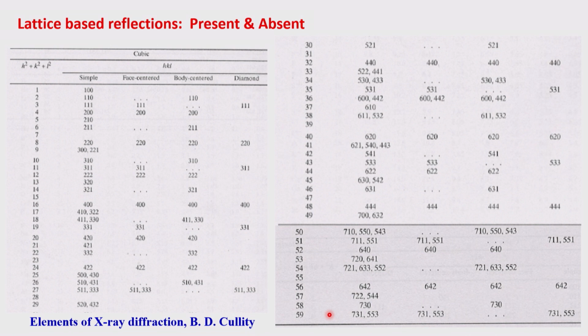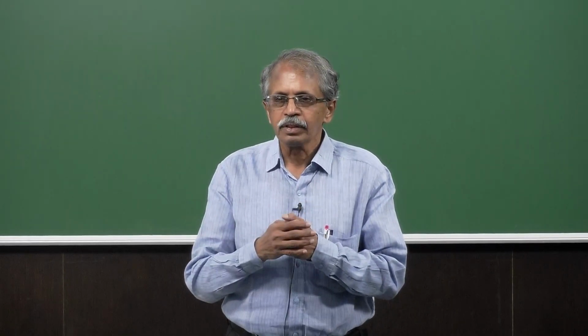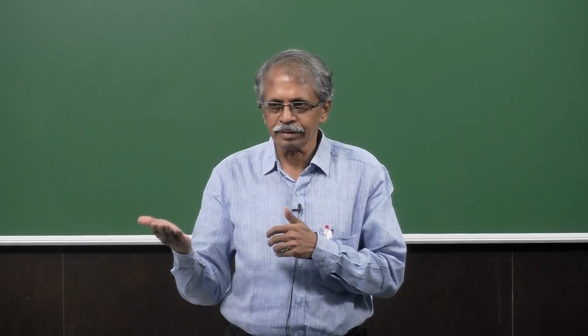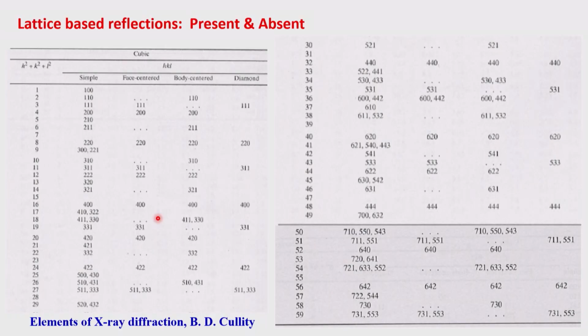I already showed you there, and this is data which is available directly. Most of the time, if you feed your data to the computer which has all this, it will work it out and give it to you as well. So we have gone through a range of information in this topic, starting from what is diffraction, which species make the diffraction, atom scattering strength, their presence in planes, and the planes' diffraction, scattering, interfering, and then making the diffraction, where you have intense or no intensity, medium intense, less intense, all of these kinds of things.